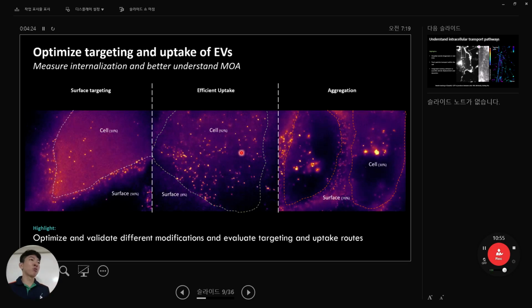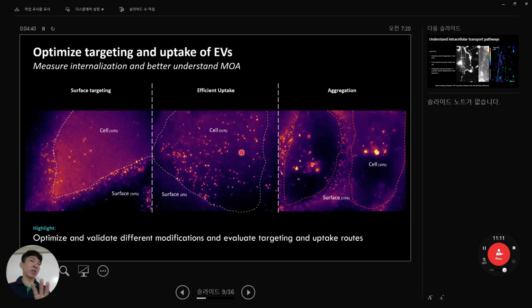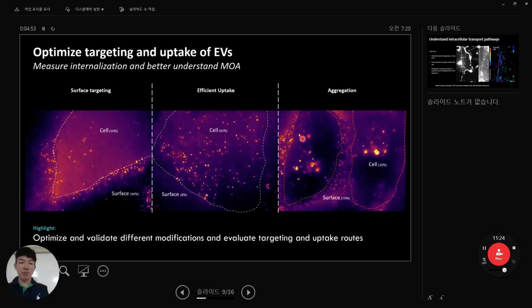They use blue, red, and far red, and far red is used a lot. For far red, they have a specific line that can be used for imaging. We already bought some antibodies for imaging. I'm going to explain later. Simply, you just change the secondary antibody. That's all.